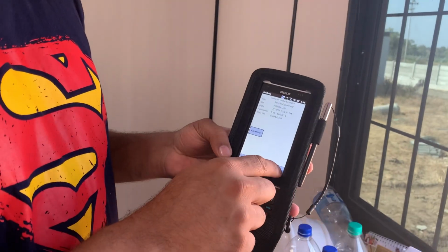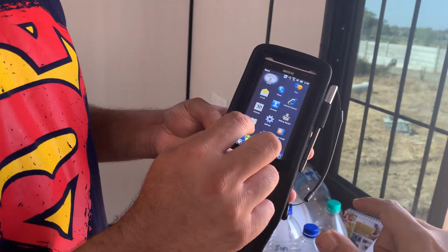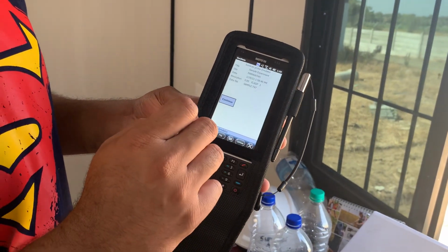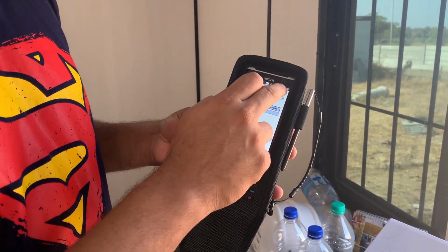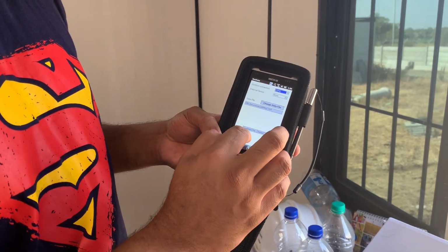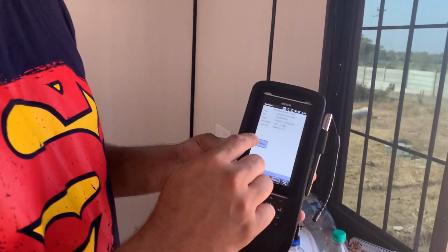So I think just close that. Cancel it. I think you'll have to go back to open the app. File, settings. See that emulator, COM2. Okay, now it's changed into the sample experiment mode.